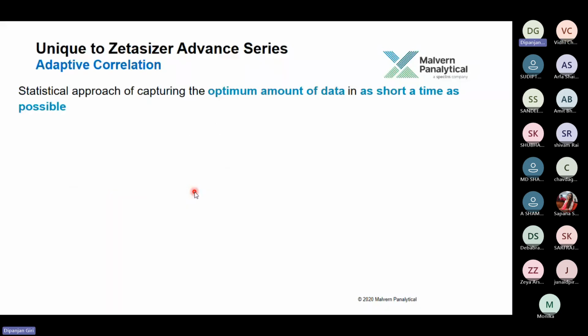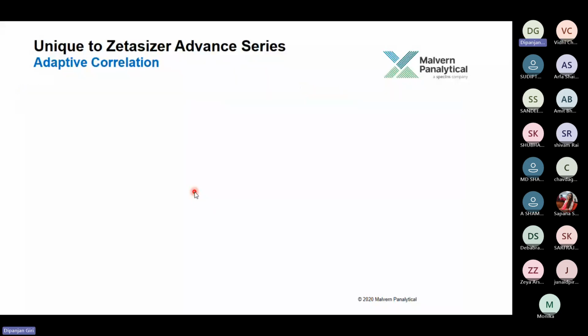These intensity fluctuations are totally independent of the instrument, so only the particles and their motion create them. A particle may behave normally, or can be clubbing, or agglomerate, or be dragged with another particle, and sometimes there may be dust particles or filter fiber. So this can be present in your system.